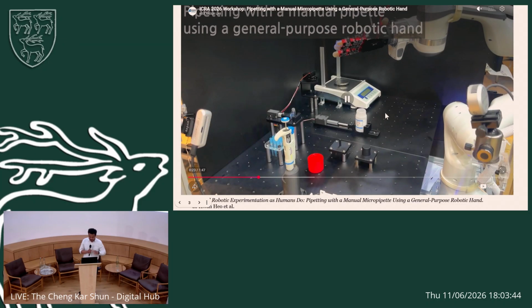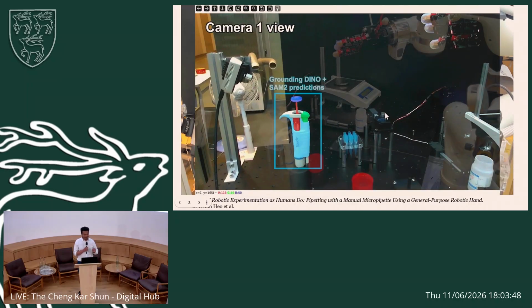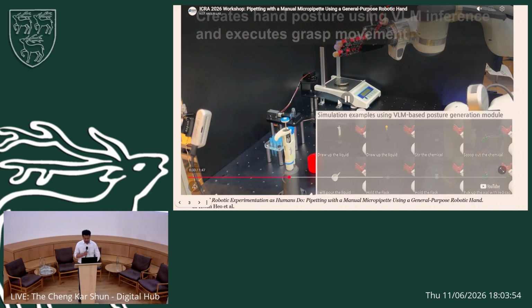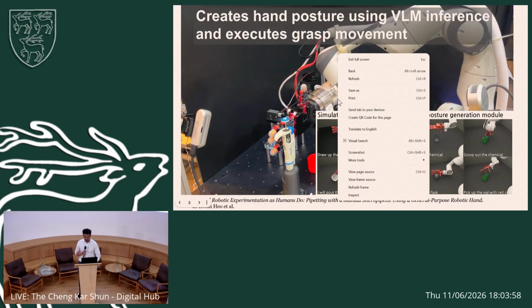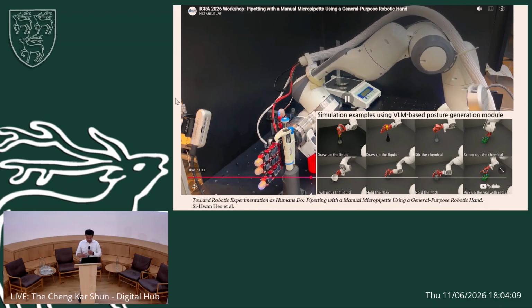And I'm showing this example to describe the gap right now that we see, from someone that works on computer vision for robotics day to day. So in this context here, they're using a state-of-the-art foundation model to perform the segmentation of the pipette and other relevant elements of the task.